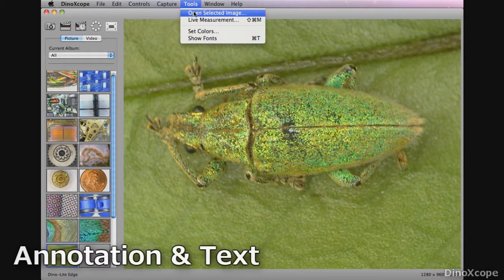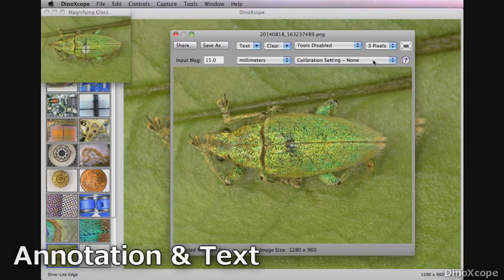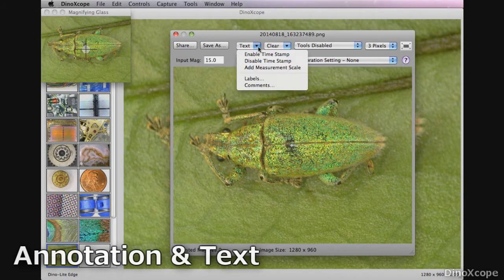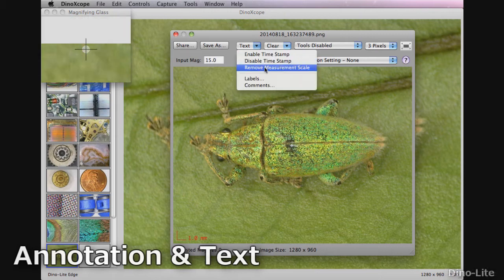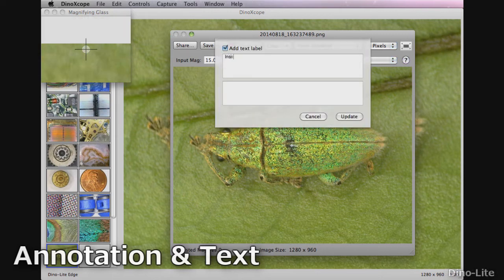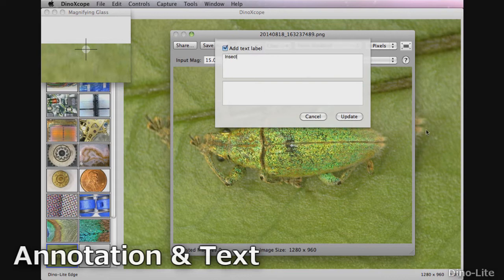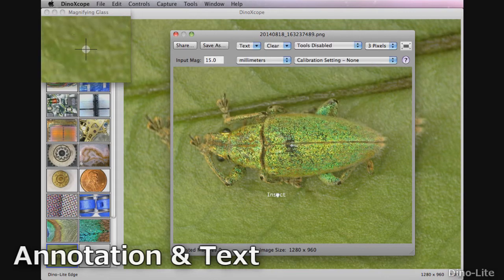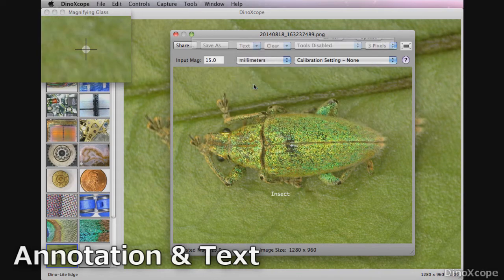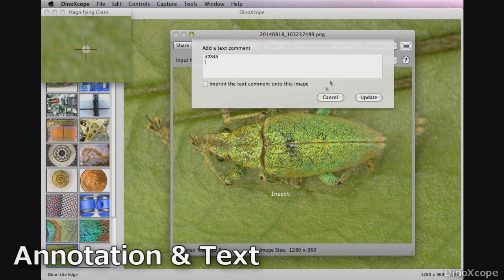To add annotations and text to an image, select an image and open it. You may double click on the desired image or go to the tools menu and select open selected image. In the image viewer there are many tools that allow you to add and edit displayed text and annotations.